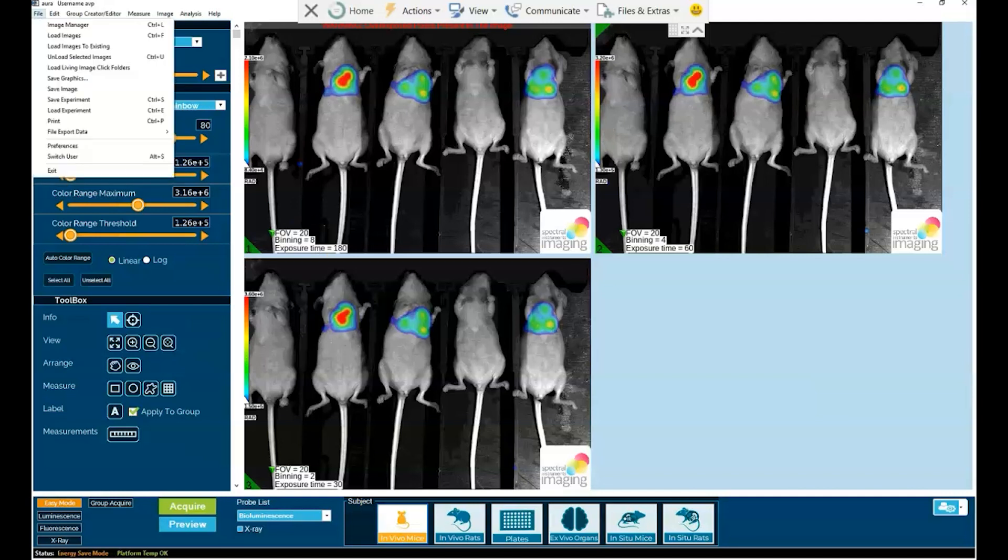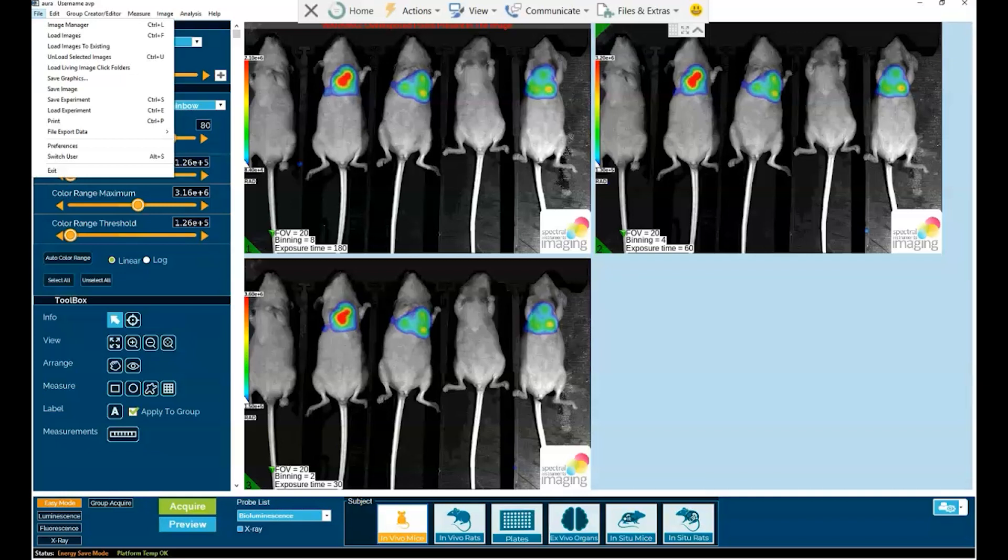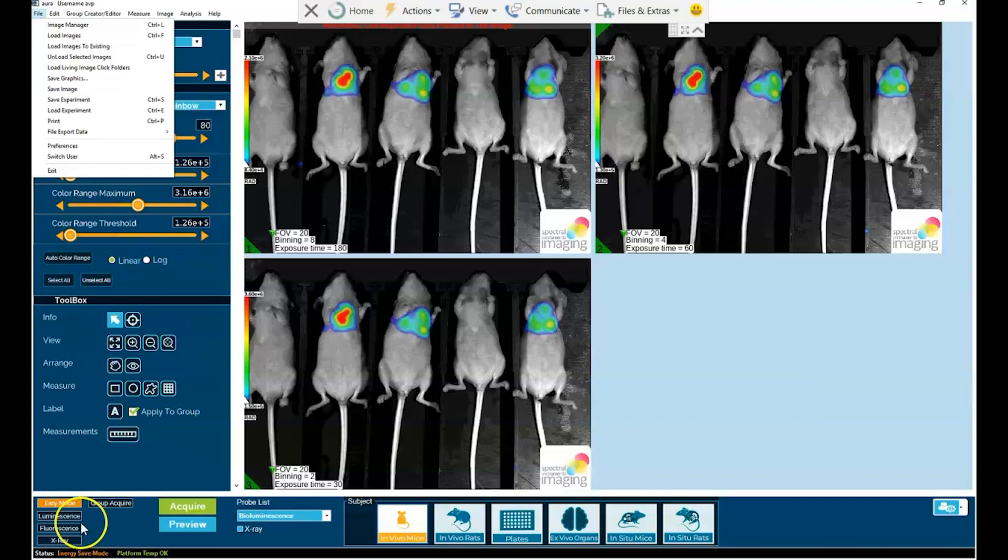Before closing, it should be noted, of course, that the previous ways of image acquisition in luminescence, fluorescence and x-ray, as noted here in the bottom left hand corner, remain available to our long time users of Aura. And if there is preference for these classic protocols, they can certainly still continue to make use of them.